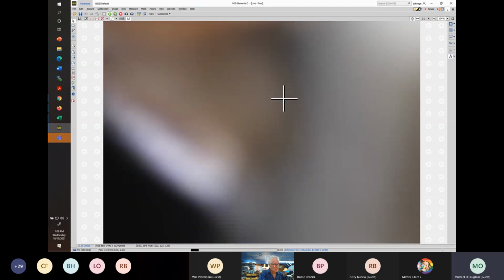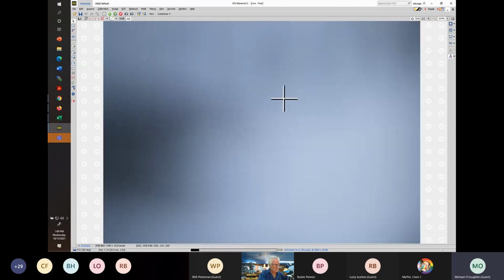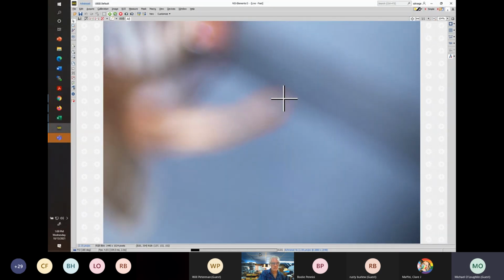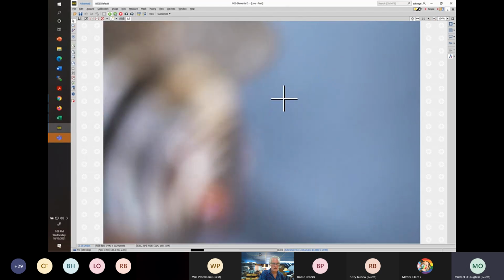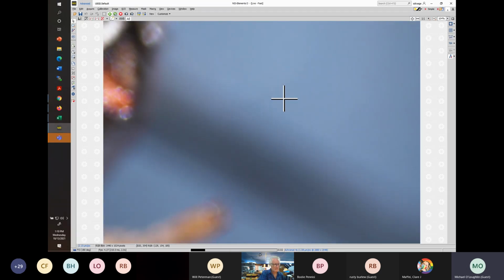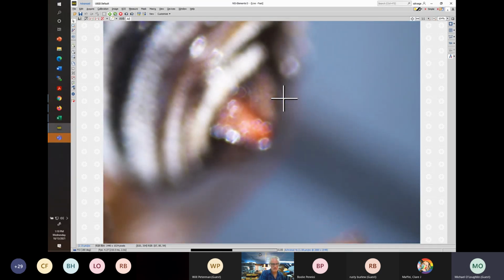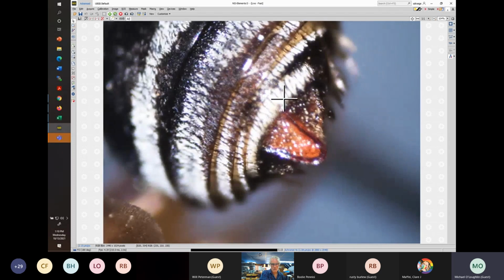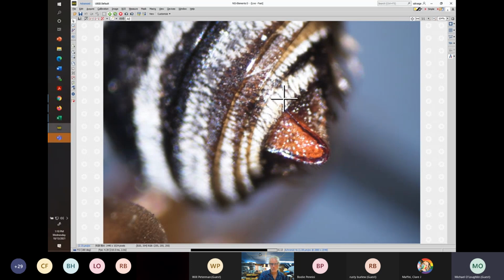But again, I'm going to try and angle it a little bit more, to see if we can peek in there. You can see how that isn't a great character because of its ability to hide from you. This is where having a collection of specimens available is good, either in your own possession, which ultimately you would want, or a place nearby that you could travel to with specimens that need to be looked at, double checked, verified.